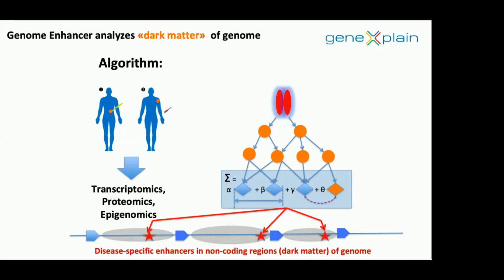But at the end of that learning, the system comes up with a composition of transcription factors which are responsible for activating those genes. They are presented in these slides as these little boxes, this composition of factors.